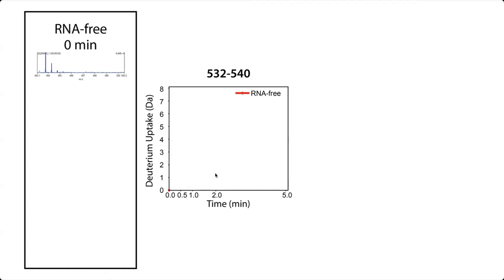On our x-axis, we have time. So we were taking time points at 30 seconds, 60 seconds, 120 seconds, and 5 minutes. On the y-axis, we have deuterium uptake. In this case, it's in Daltons.